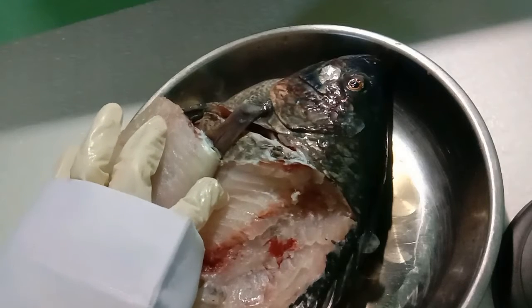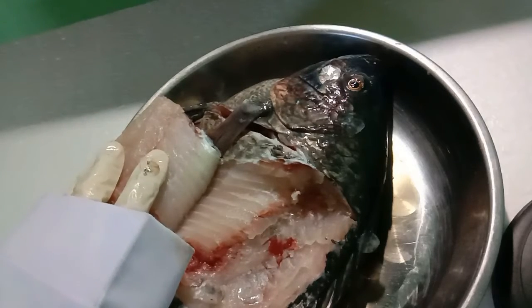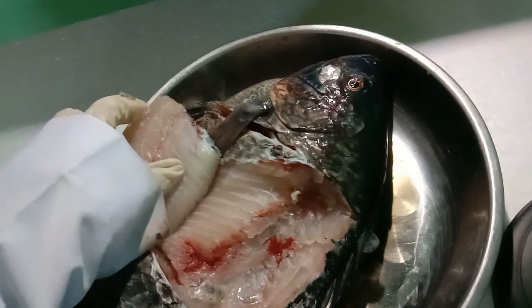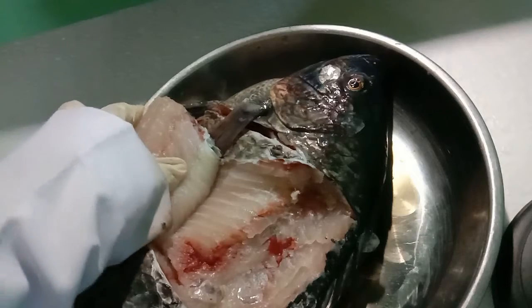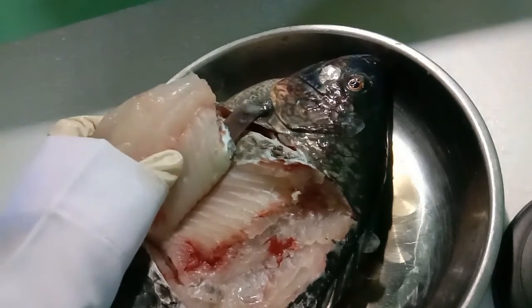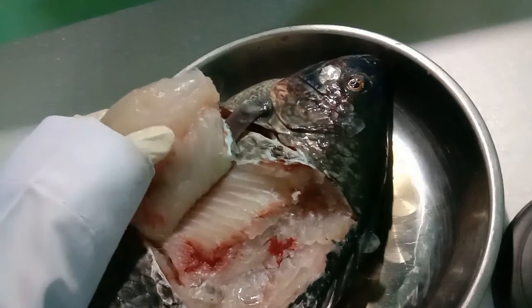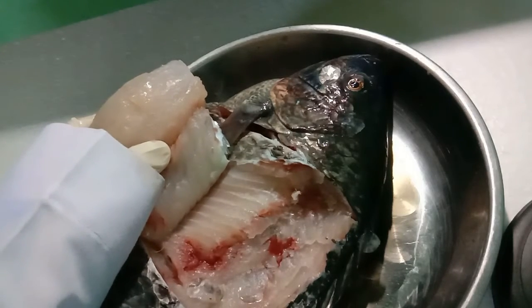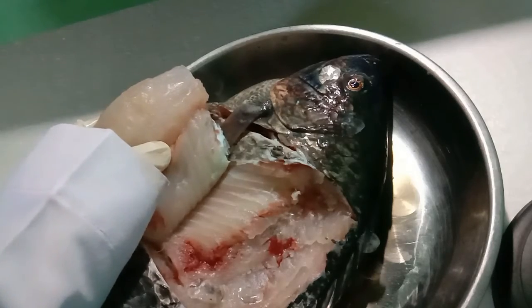The epaxial muscle can act through the cranio-vertebral interface to dorsally rotate or elevate the neurocranium relative to the vertebral column. These are the only muscles that cross the cranio-vertebral joint and can generate cranial elevation.